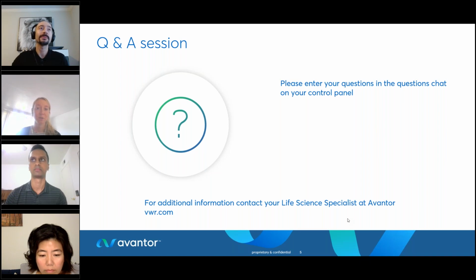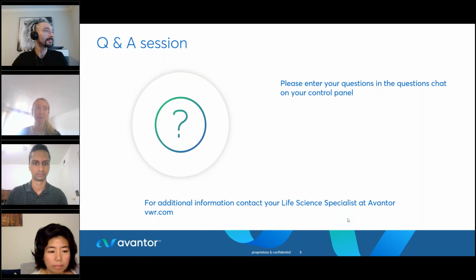Yes, that's a good question. So we filter between 0.5 times and 1.5 times the approximate size that was included. We do this so that there is plenty of data available for the assembler, and we're not filtering out any data that might potentially be useful for the assembly. The assembly will ultimately use a subsample of the best quality data available from that sample. But yes, we just don't want to filter out any useful data for the assembly. So that's why we give that wide range.